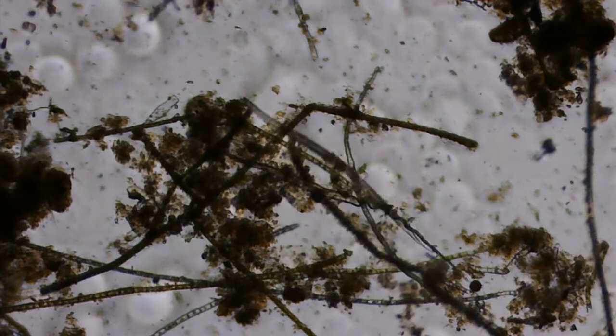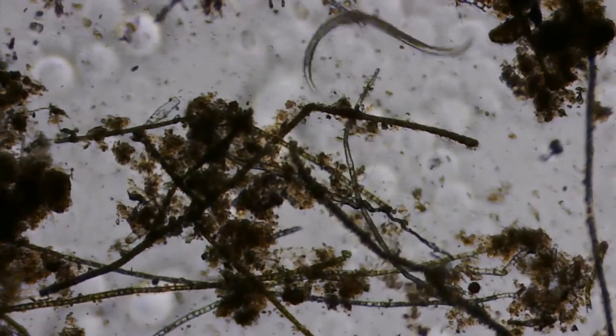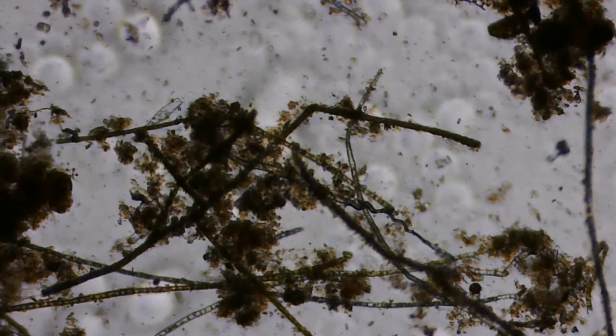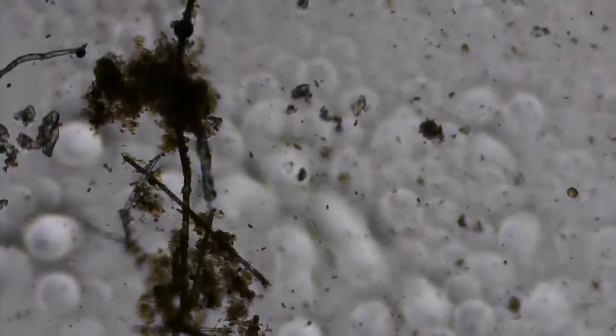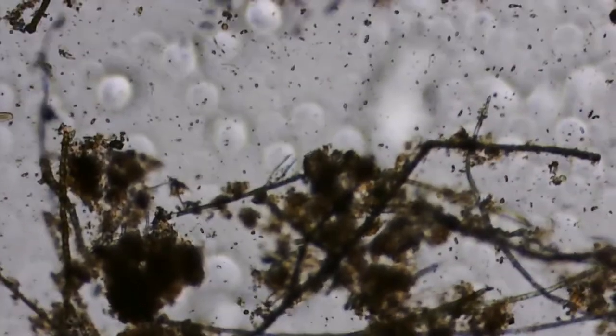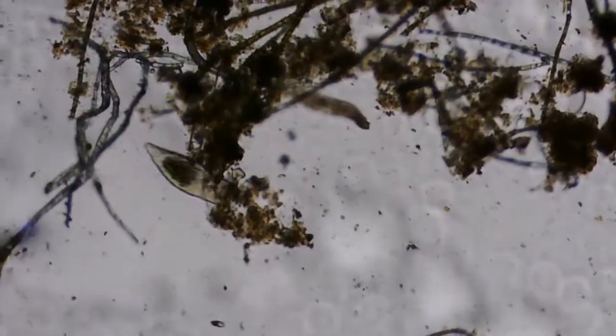Nematodes are so populous across the entire world that it's said that if you removed every single animal in the world apart from nematodes, you'd basically be left with ghost-like forms created by a film of nematodes across these animals, and you'd probably be able to identify the animals from the species of nematodes. See, this water's absolutely teeming. Unfortunately, most of what we see here is way too small for us to identify unless we had some greatly magnified footage of it, but it will inevitably be euglenoid, ciliates, that kind of thing. Oh, that was some kind of ciliate, don't know what it was.